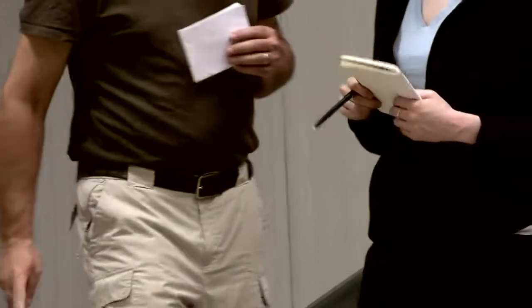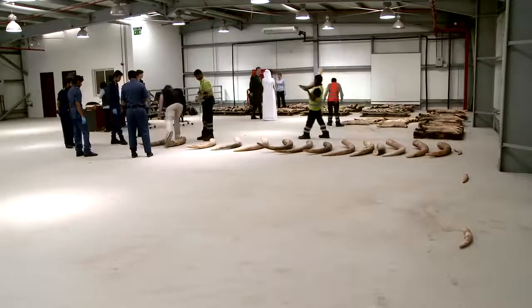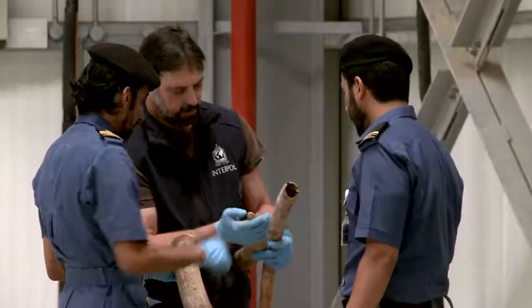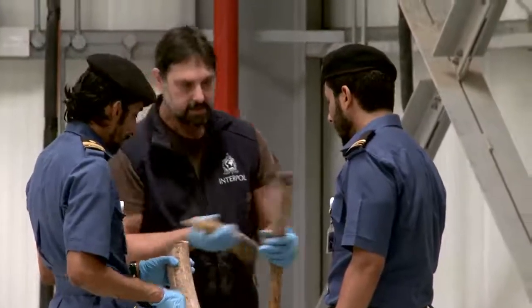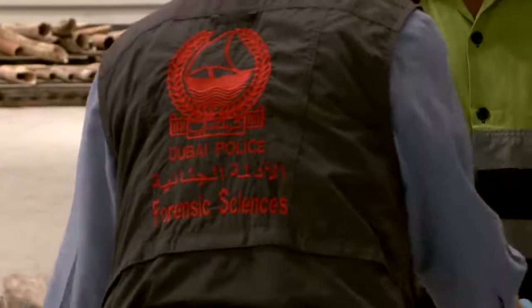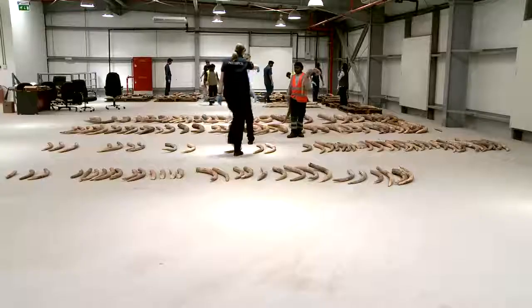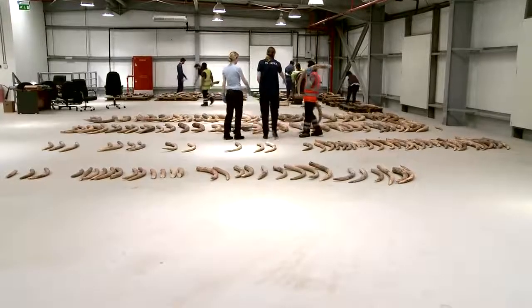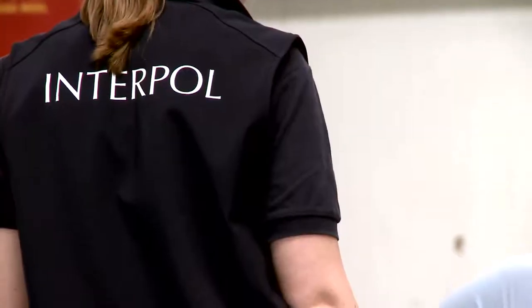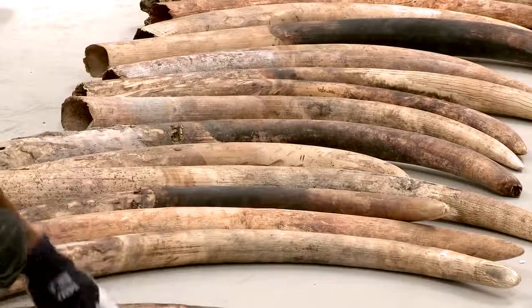All information should be recorded and documented throughout the entire process. Start by recording all information you have about the ivory seizure, including the date the seizure was made, the location of the seizure, the name and agency of the person who made the seizure, and any known transit or suspected destination countries. If the seizure has a case number, record this as well.